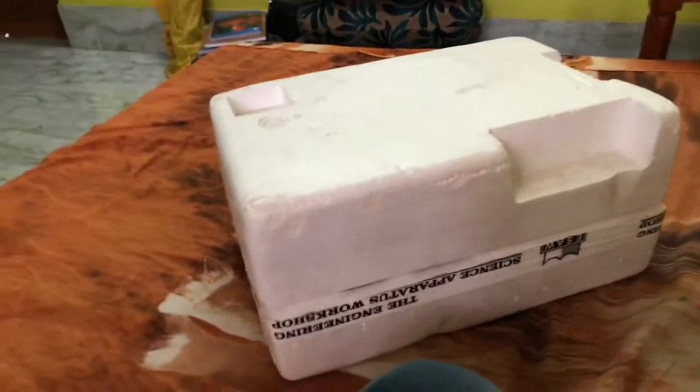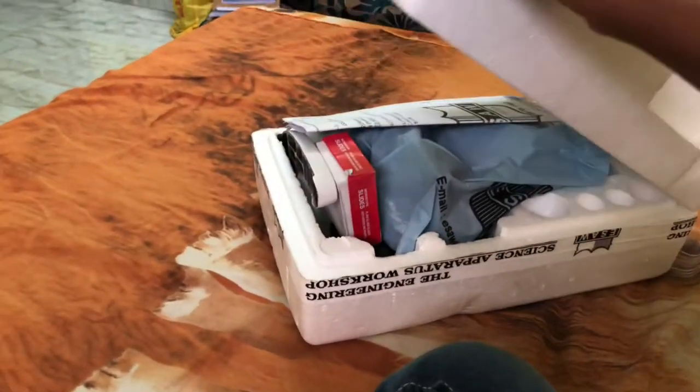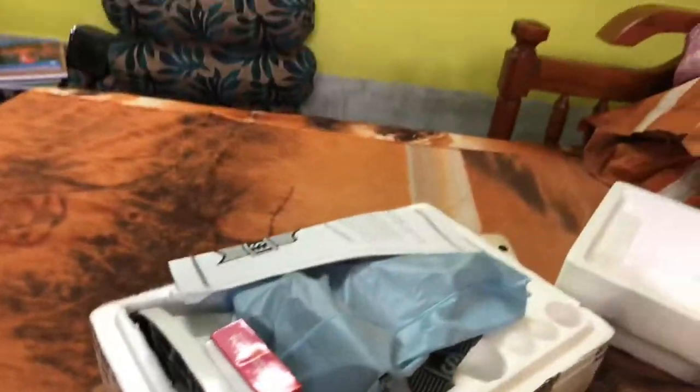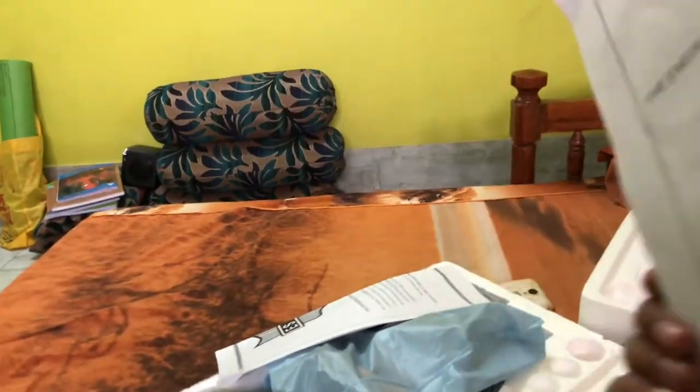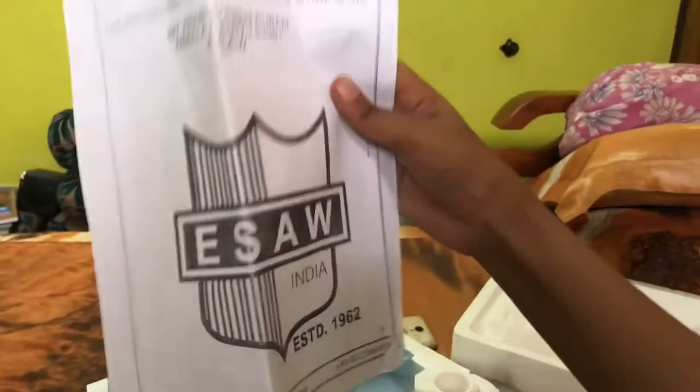I'm going to open it. So, look nicely. Wow, what is this? The manual — let's see. It's a manual. I don't want it, I already know.